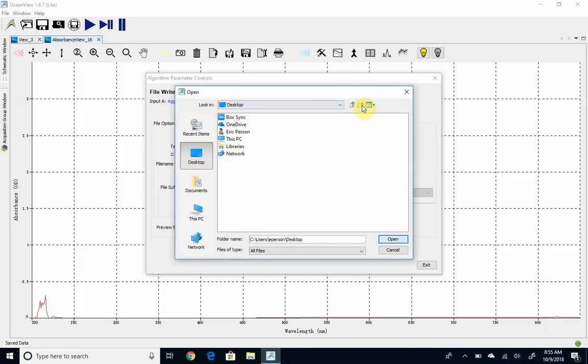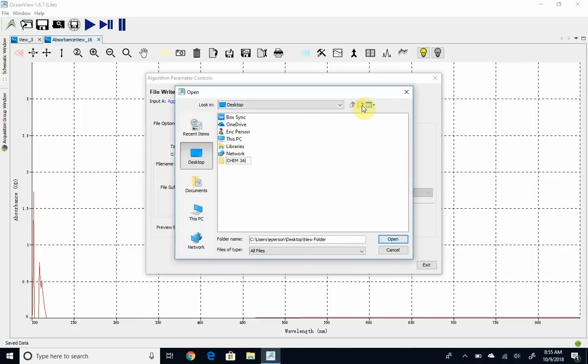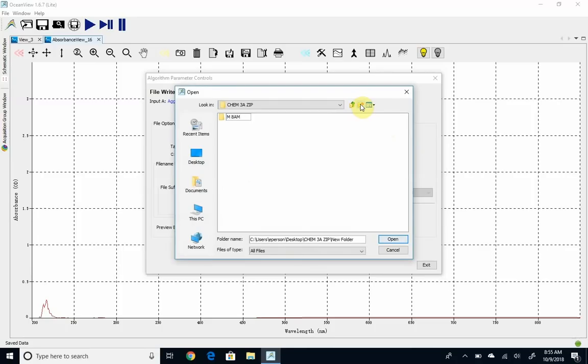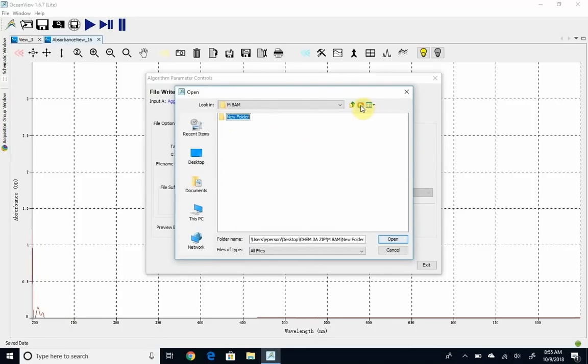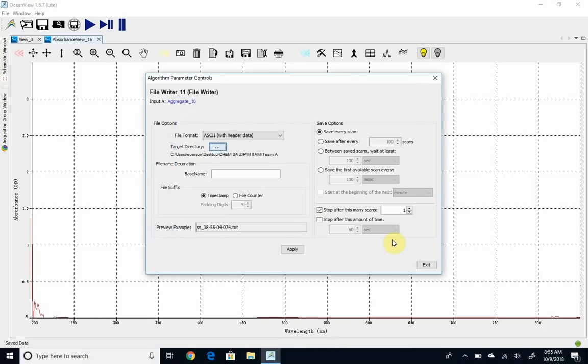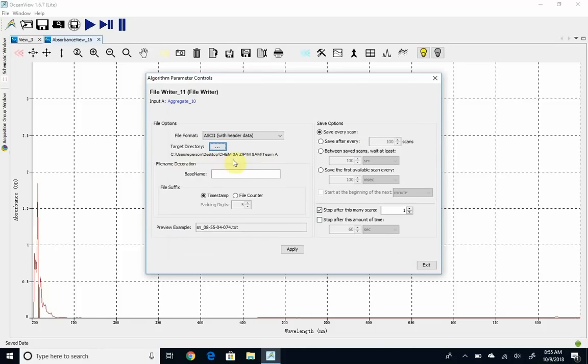I'm going to create a new folder called Chem 3A zip. There's probably one there for you. And in here, I might create one for my Monday 8 a.m. lab. And let's say I'm team A. We'll go ahead and with that, click open. And that will now store below there where it says the target directory.